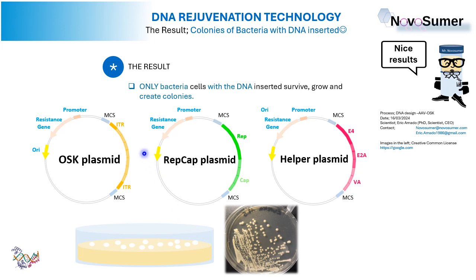And let's read with me, okay? It says here, only bacteria cells with DNA insert will survive, will grow, and create colonies. So what is this telling us?